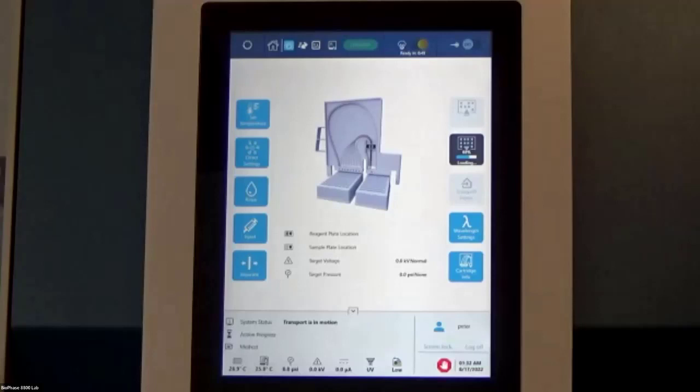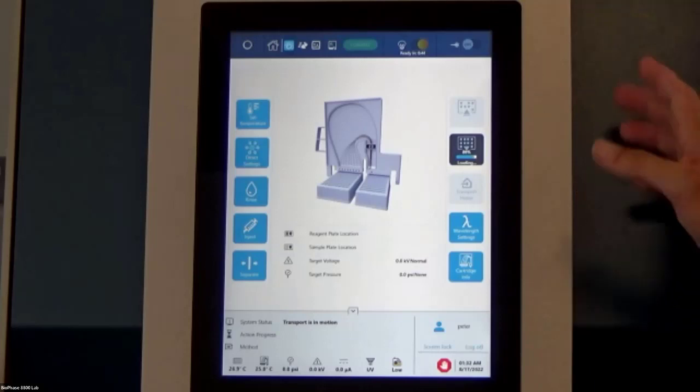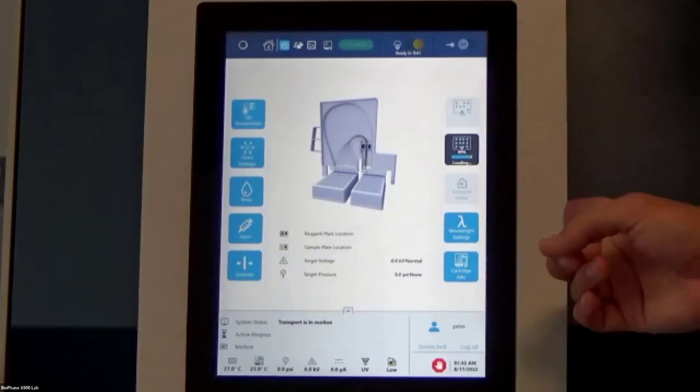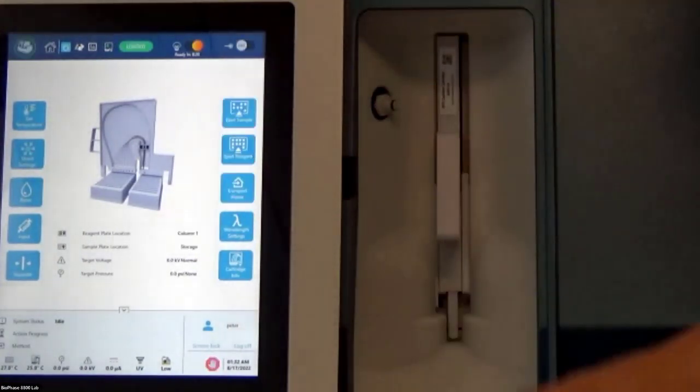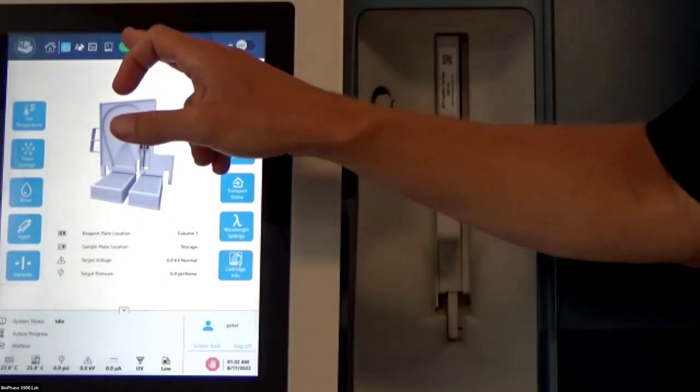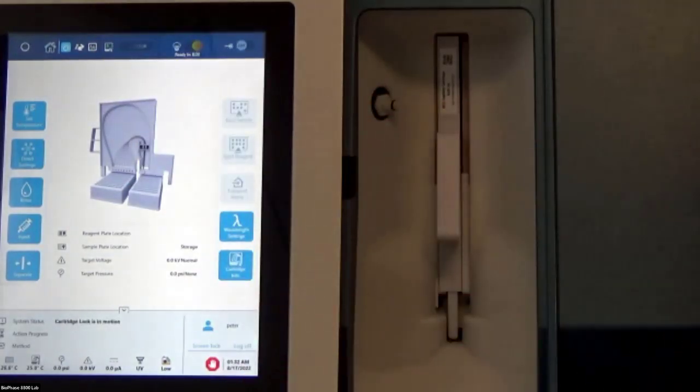Now the next thing that we want to show, we're going to switch back to that front panel view, because I forgot to show you guys this before when we were going over the front panel. Where exactly is the cartridge stored? So on the BioPhase 8800 system, we just slide this touch screen over to the left, and on the top middle, click a button. The cartridge becomes ejected, or it no longer loads in. So right now it's ejecting our cartridge. And then once it's fully ejected, I'll be able to pull it out.